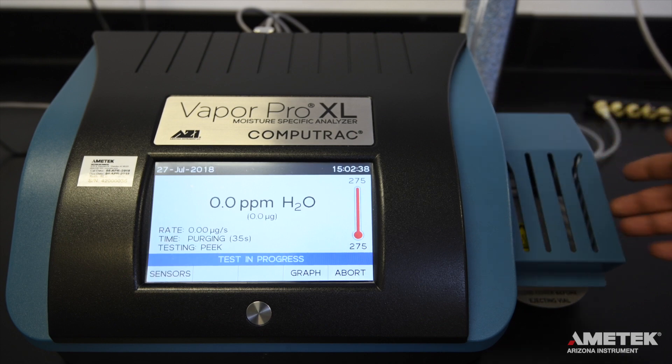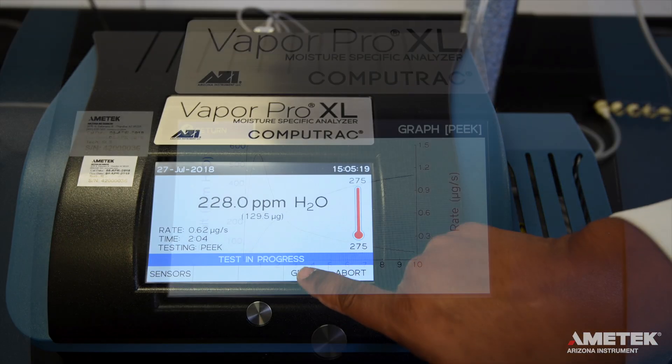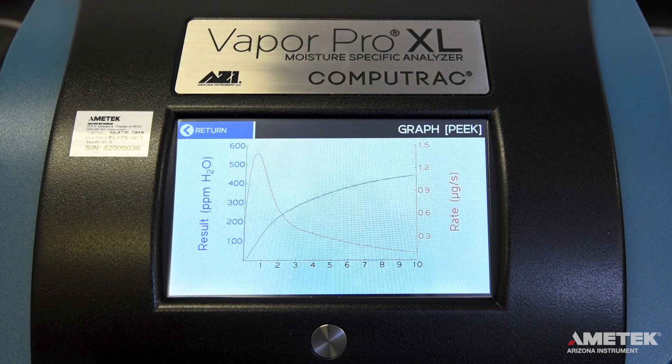As soon as the ramp cover closes, the instrument will pull the bottle into the heating chamber. While the test is running, the home screen will show the test run time, a real-time moisture value in the program's set result display units, and the rate of moisture evolution in micrograms per second. You can select the graph button at the bottom right of the screen to see a visual representation of the result in the selected units and the rate of moisture evolution.